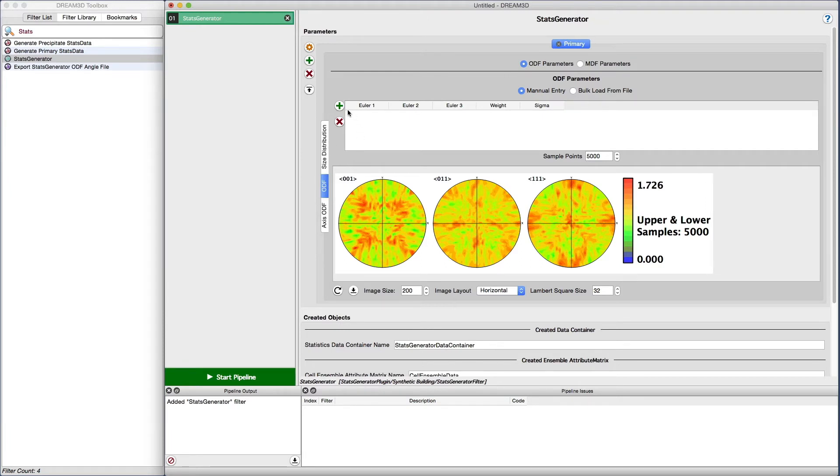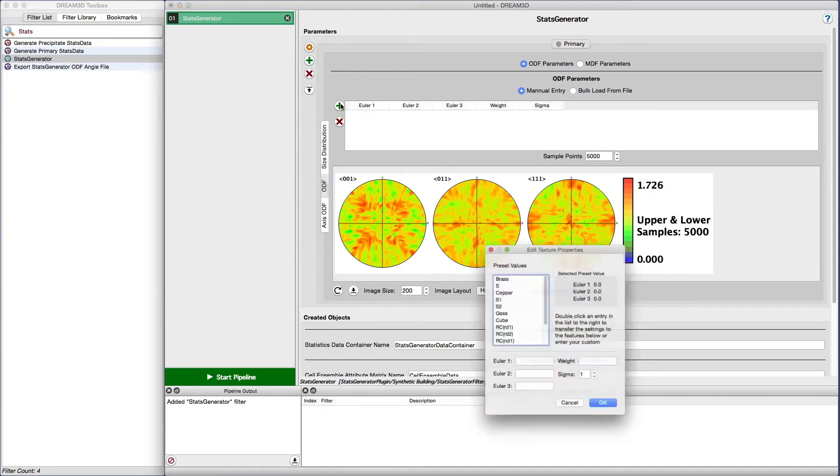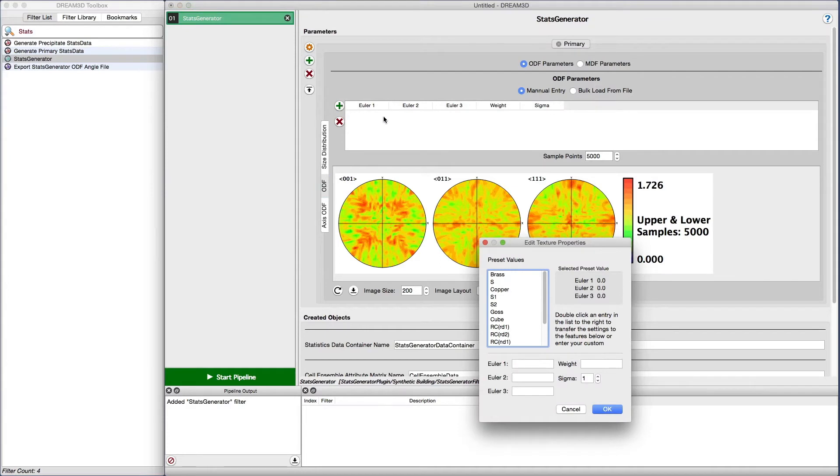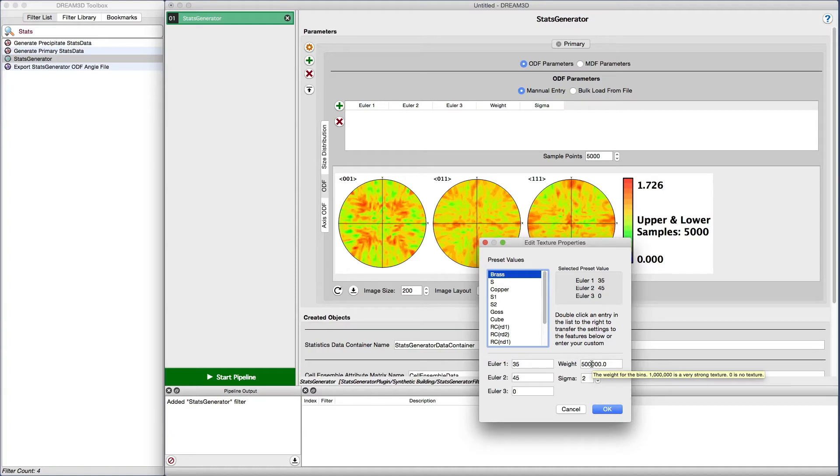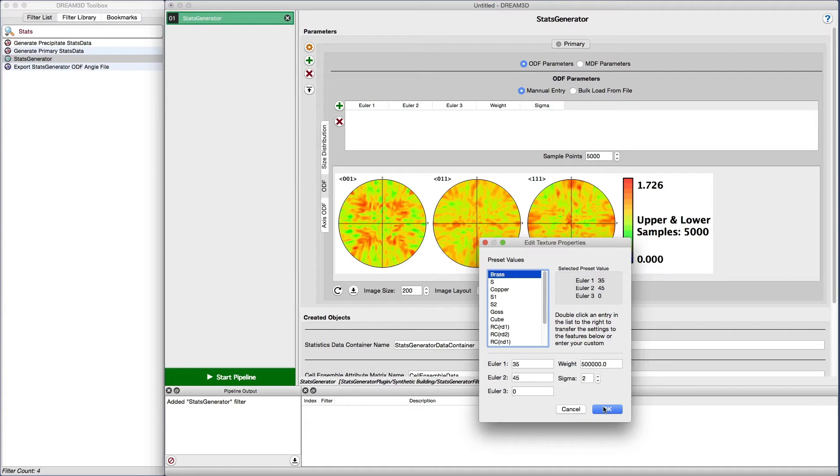We would like to add a texture to the synthetic microstructure using a brass template. To do this, we click on the add ODF weight button to bring up the dialog box where we will enter our values. We double click on the brass selection from the list. This will give us an initial angle set of 35 45 zero. Note the initial weight of 500,000 and a sigma of 2. The weight factor tells the algorithm how strongly to pick values from that angular bin and the sigma value tells the algorithm how quickly to taper off the distribution. Let's leave the default values and see what the pole figure looks like.